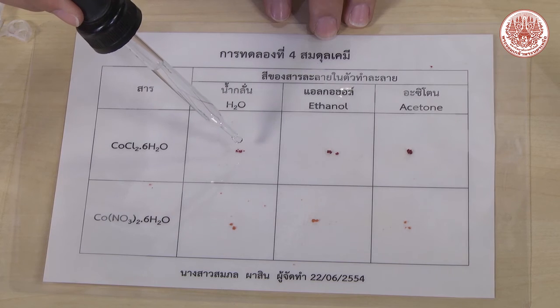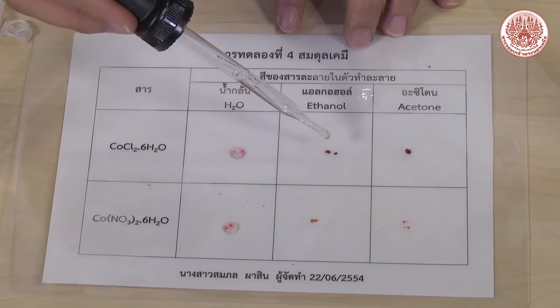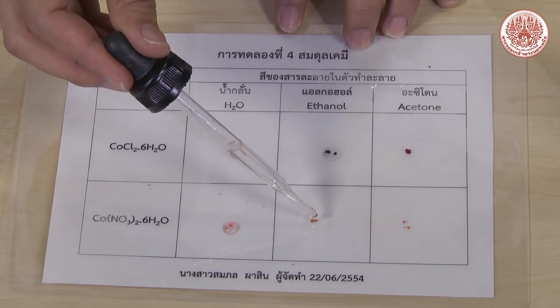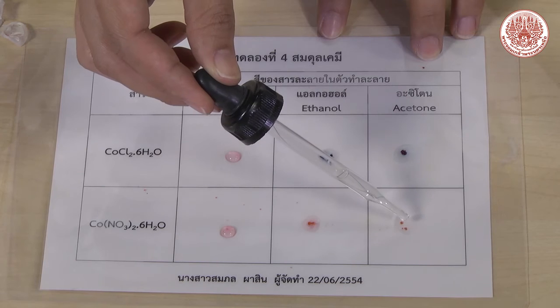In the first column, add water one drop. The second column, add ethanol. And acetone is on the third column. Record the color of the solution.